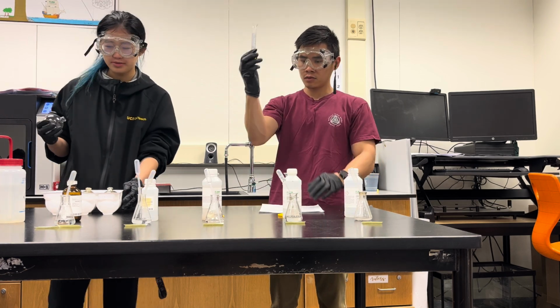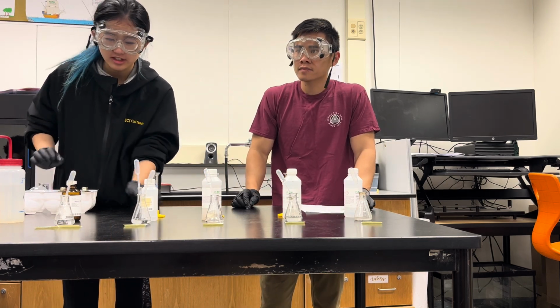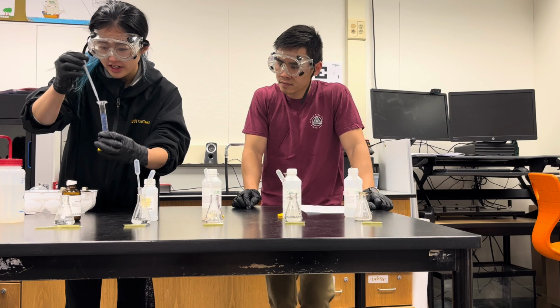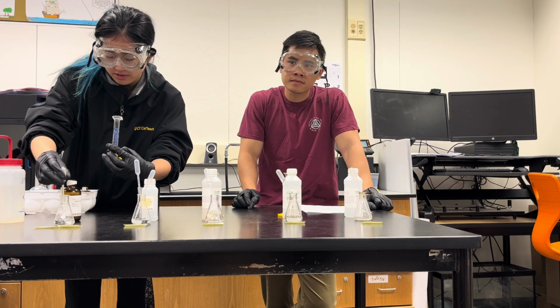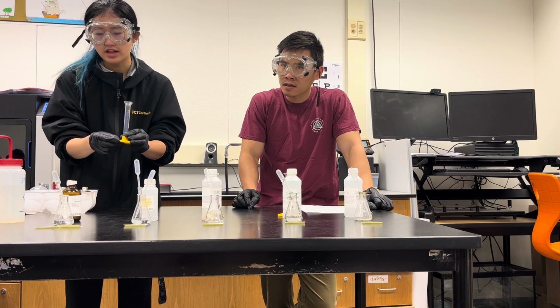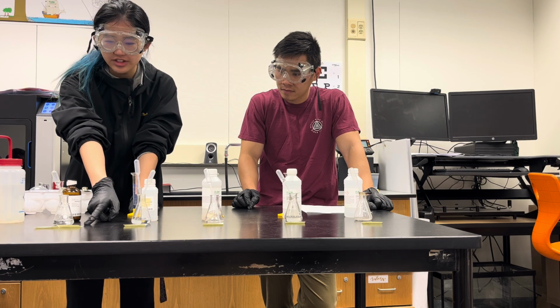And with this last one, Miss K, what do I need? For the last one, you're gonna put 2.5 milliliters of the silver nitrate solution. So I'm gonna fill it up to the 2.5 line. Also, be careful when you're using the silver nitrate because if it gets on your skin or your clothes, it will stain it. That's why we have gloves on. What color will it stain? It's like brown. Brown color. Oh.